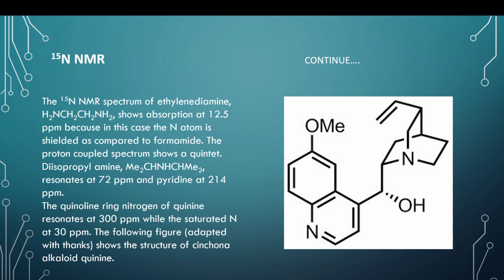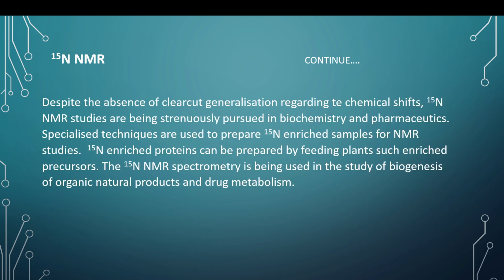The structure of the molecule is shown, adapted with thanks. You know this alkaloid is found in quinine, in the cinchona plant. Despite the absence of clear-cut generalization regarding the chemical shift data, 15N NMR studies are being strenuously pursued in biochemistry and pharmaceutics, in medical sciences.